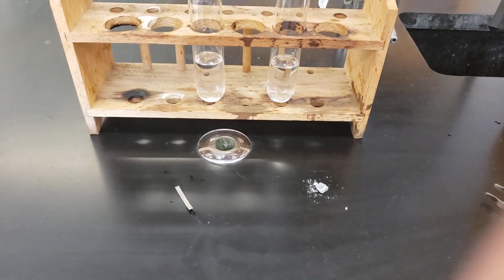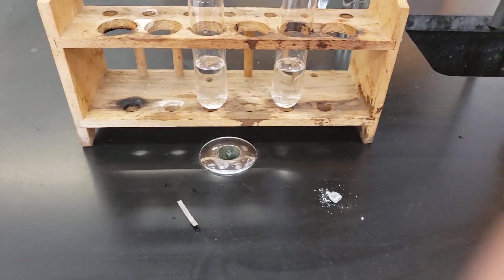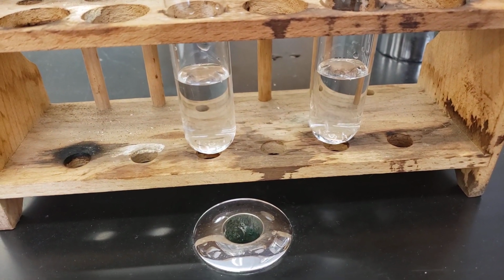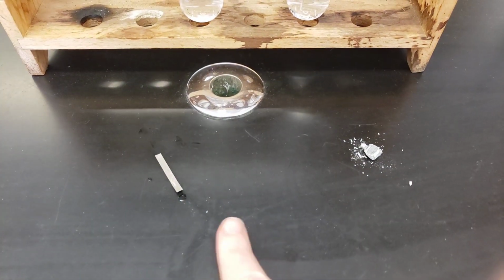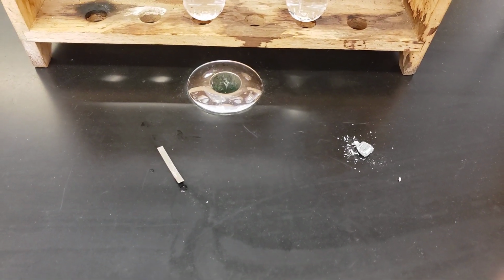Today we're completing our periodic trends lab. In part one, we're investigating the trends of some metals in water, how they react. So in both of these test tubes right here, I have just regular plain old water. Then in front of each test tube, I have magnesium and I have calcium. And we're going to investigate how they react in water.